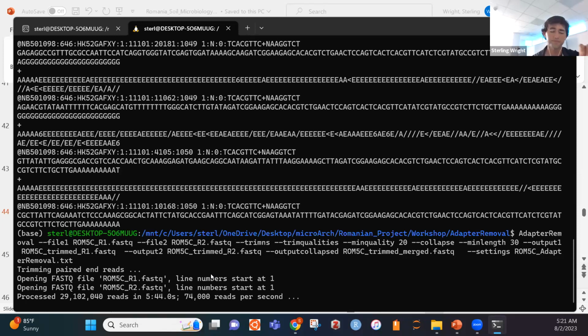And I'm going to be going through a couple of the next tools where we won't be able to actually run them. I'm not going to run them today because they could take up to 13 to 15 hours, and that's when I even have access to terabytes of memory.